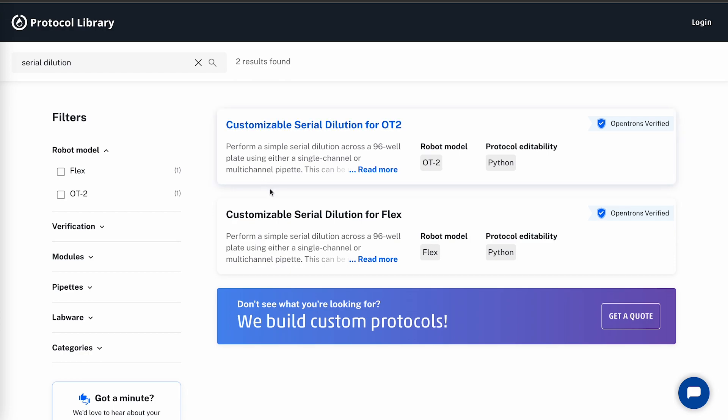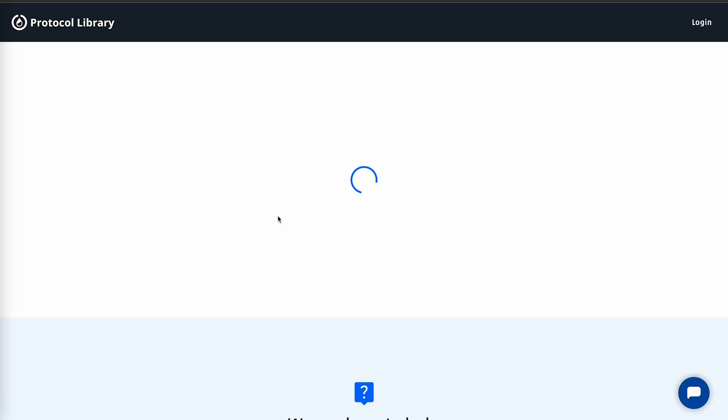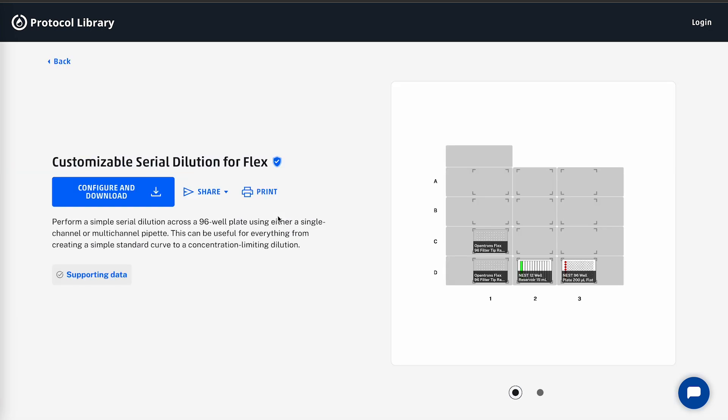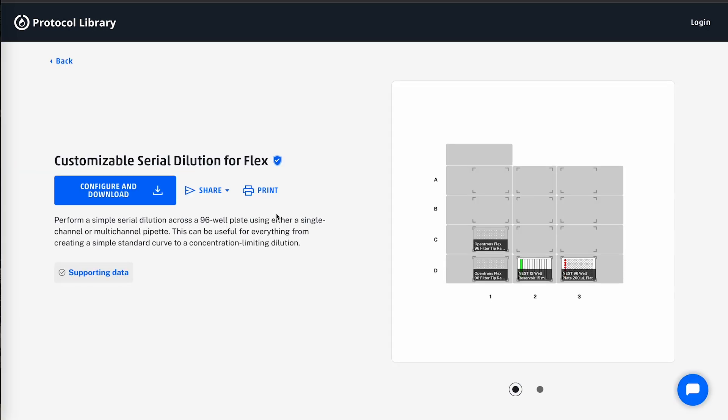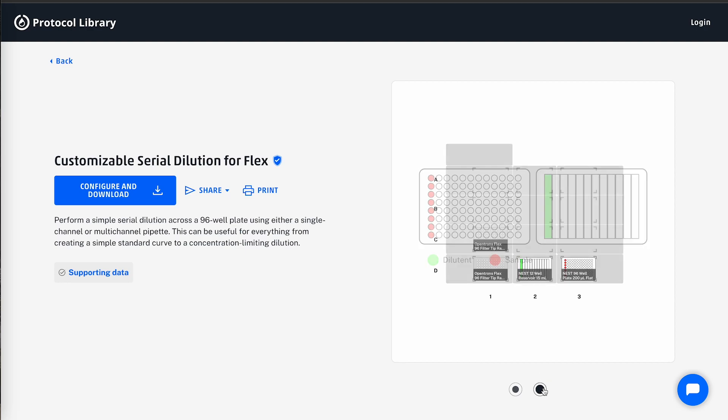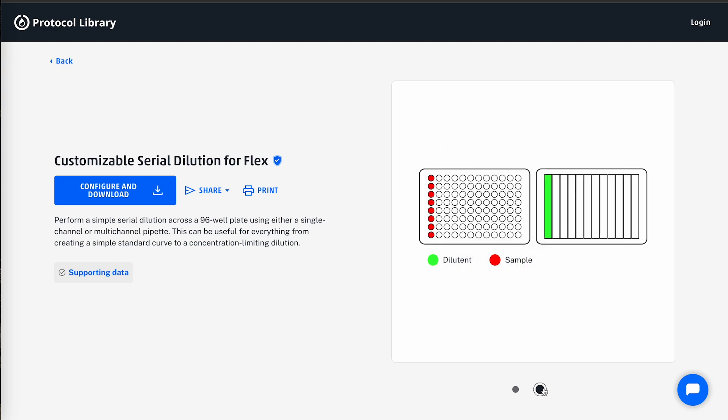Since I have a Flex, I will use the customizable serial dilution for the Flex. There's a lot of useful information on this page, so let's take a second to review all of it. On the right-hand side, we have the image carousel, which shows the deck map as well as the starting liquid needed in each labware.